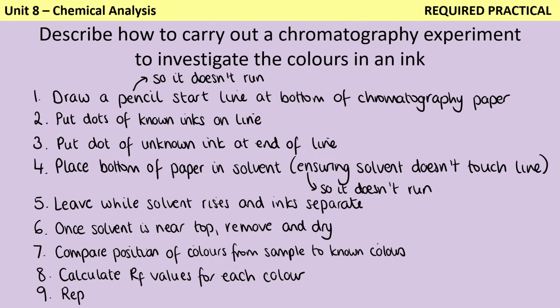Strictly speaking, you should also repeat this again using a different solvent, because lots of different substances have different solubility in different solvents. So if we know that 2 substances are appearing in the same place in multiple solvents, that gives us additional evidence that they are actually the same substance.